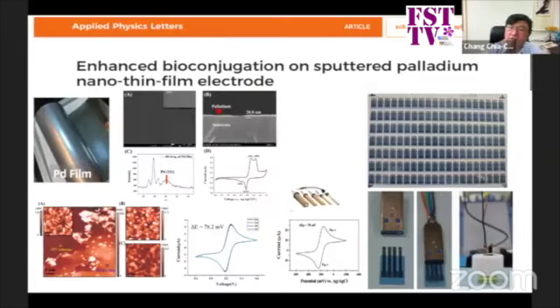In previous studies, people found that to generate one stable 111 structure, they need to use a silicon surface with 111 orientation as the substrate.